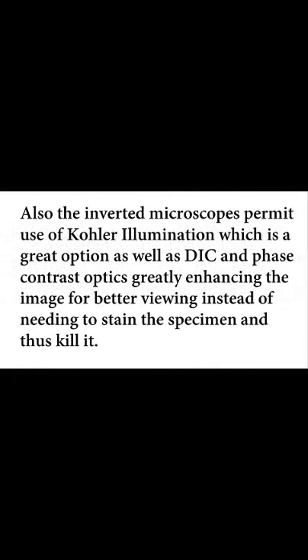Also, the inverted microscope permits use of Koehler illumination, which is a great option, as well as DIC and phase contrast optics, creating different shades of brightness, greatly enhancing the image for better viewing instead of needing to stain the specimen.